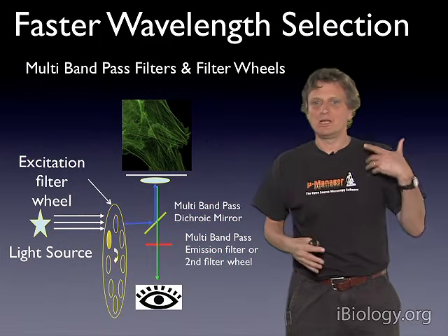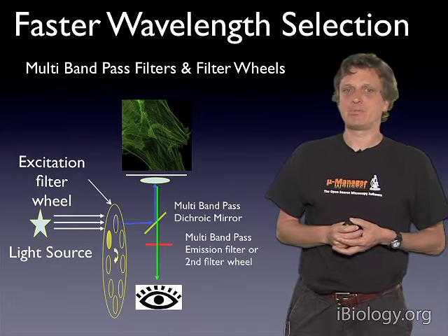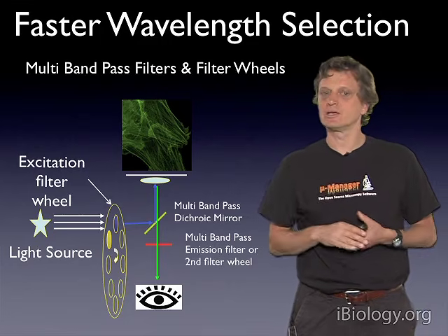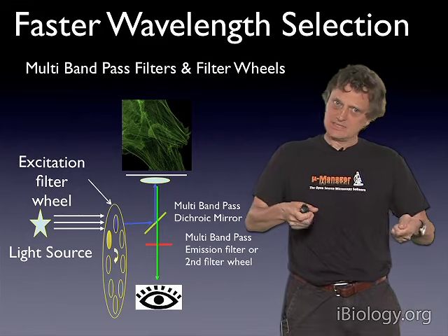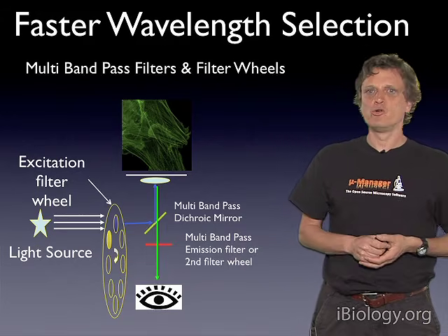There are also alternative strategies to doing this. And one is, what you may have noticed in the lab part, is that it actually takes quite a bit of time to move that turret. So going from one position to the other takes, quickly, like half a second or so. The turret is pretty big, so it has a lot of vibrations. If you want to go faster, the whole thing starts moving more.